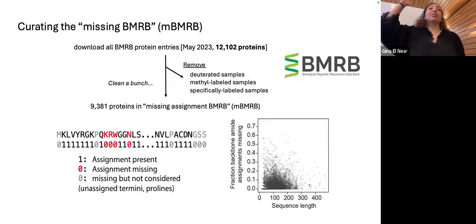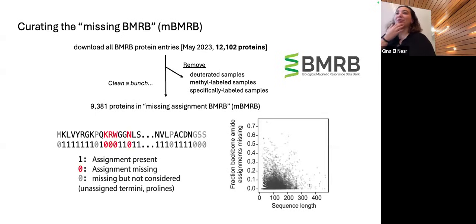Well, the cutoff in the training was 400 residues, and we don't have that many in our final training data set between 300 and 400. The majority are actually less than, I think, 220. There aren't that many that are that long, but something really recently got deposited that was like 900 residues. I was like, this is crazy. Yeah, the distribution is kind of clear. It's mostly like 150. We did the data filtering after, and it reduces significantly when you remove redundancy.